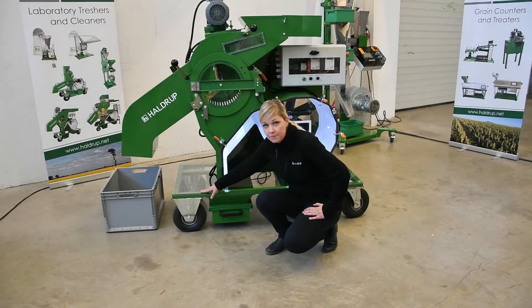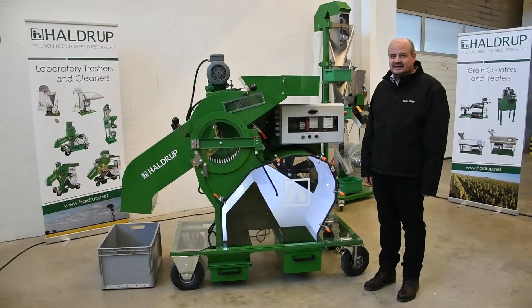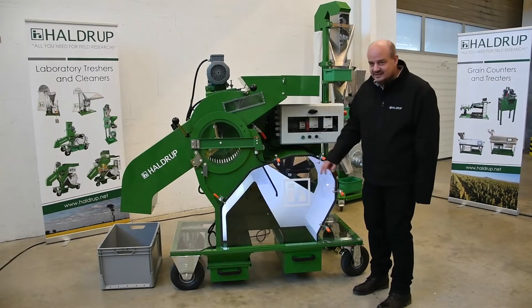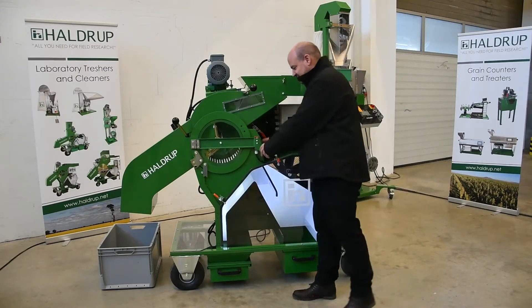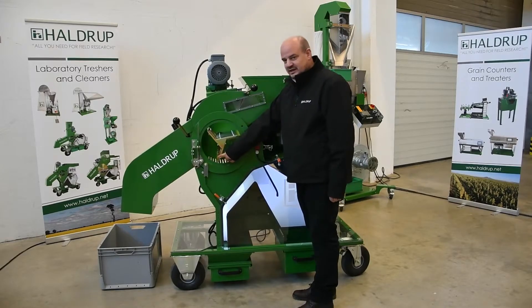They also added plexiglass covers on the machine frame on both sides. There are now some new options on these machines. One of the options is LED lights to check the machine. One more option is the air supply on the threshing drum to clean the machine.